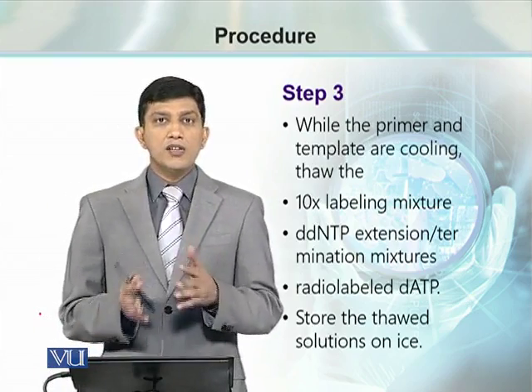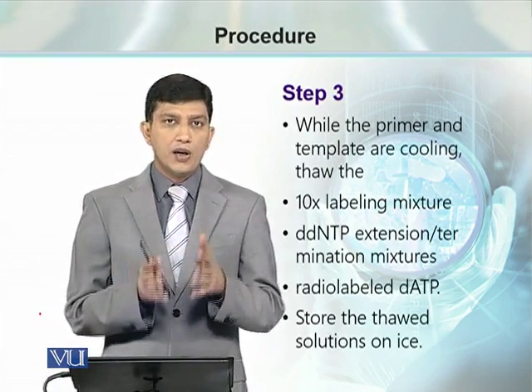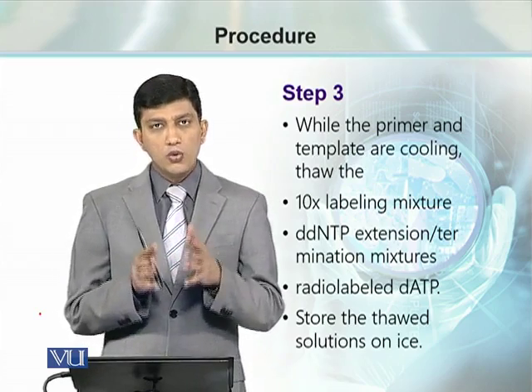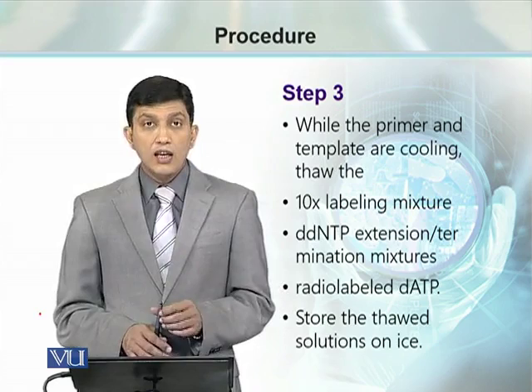Now, during these 3 to 5 minutes while our sample annealed with the primer cools down, we have to prepare the labeling mixture.